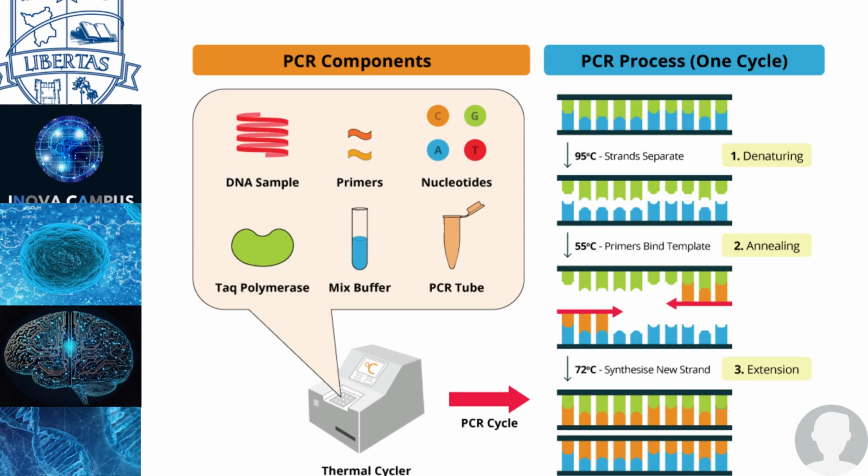The process behind PCR works like this. You collect a DNA sample, and you put it at a high temperature, usually 95 degrees Celsius. Then naturally the DNA is going to denature. Y'all know that DNA is a double helix, double stranded.